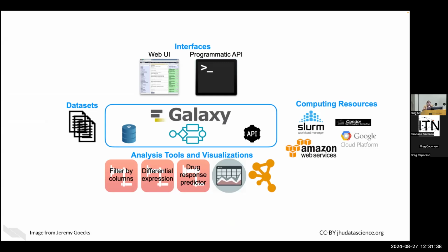And the platform is built to use computing resources that are stable and has a lot of computing resources available for you. So as Carrie was suggesting, if your computer just isn't enough, if you just don't have enough resources, as Greg was saying, you're going to move into analyses that require really big files and are going to need a lot of computing power, Galaxy can be an option for you because it has that computing power available and it can run it without overtaxing your laptop.